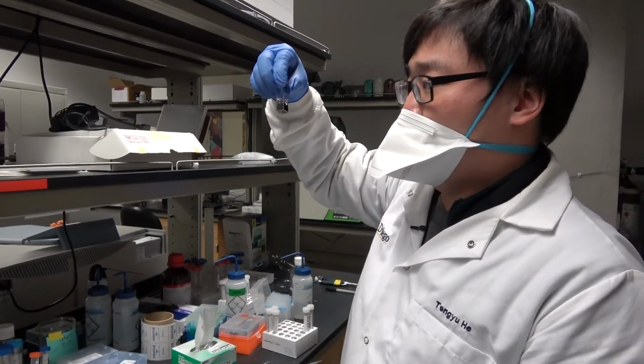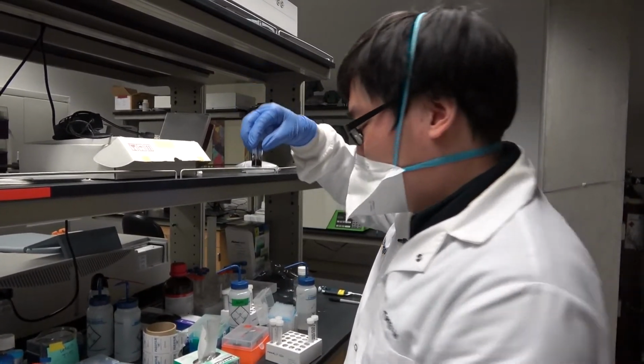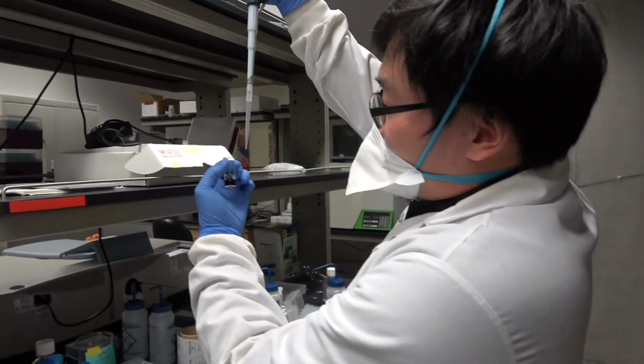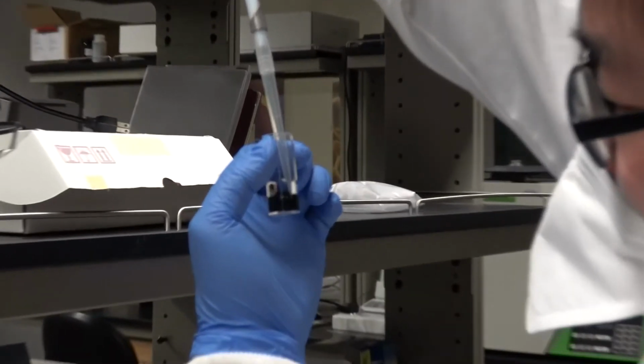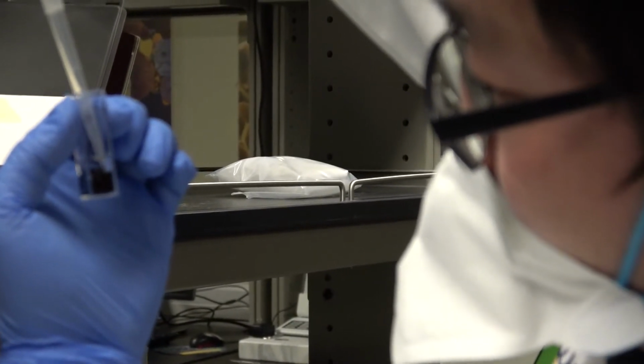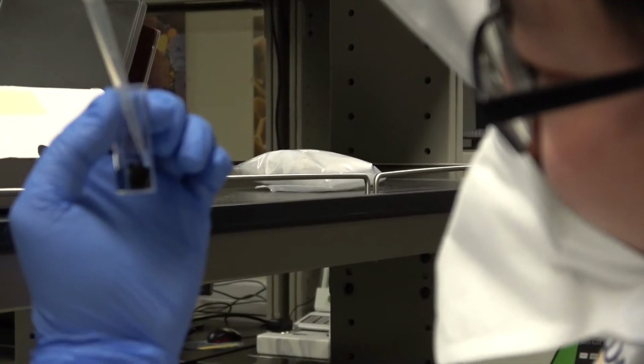There will be some bubbles, and if there are bubbles, we have to mix it a little bit with the pipette to make sure there are no bubbles in the window we are going to image.